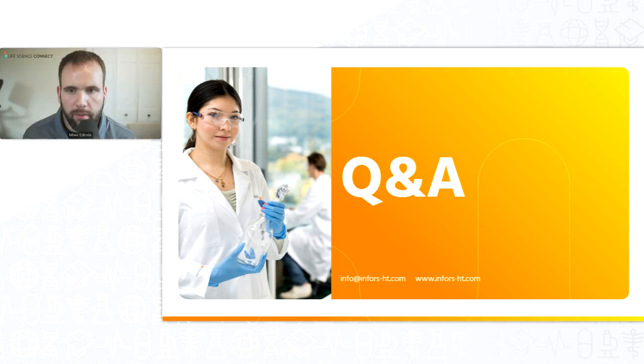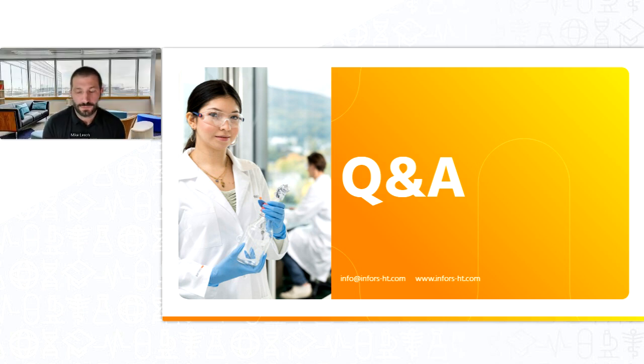Another one here, Mike, probably for you. Can you clean and sterilize the BioBird inside the incubator by using UV? Yes, you can. We do have a UV sterilization option with the Multitron. UV light gets placed in the bottom of the cabinet, and it's going to sterilize external air that's coming into the cabinet. So it's going to clean the airflow coming into the cabinet.